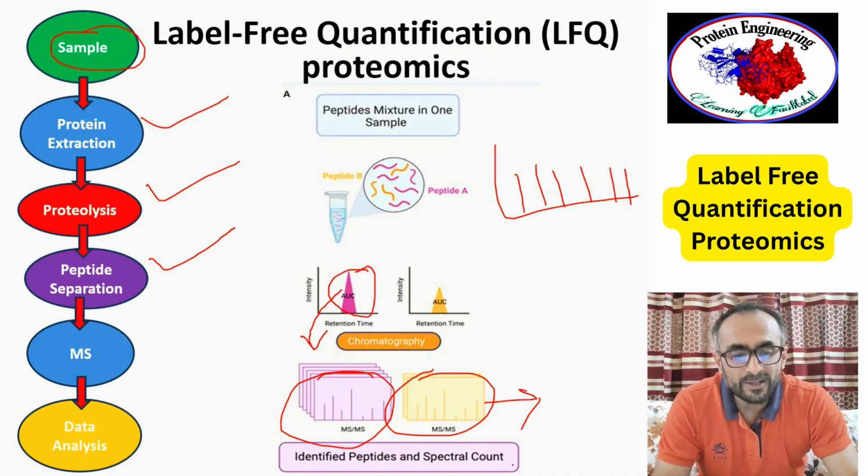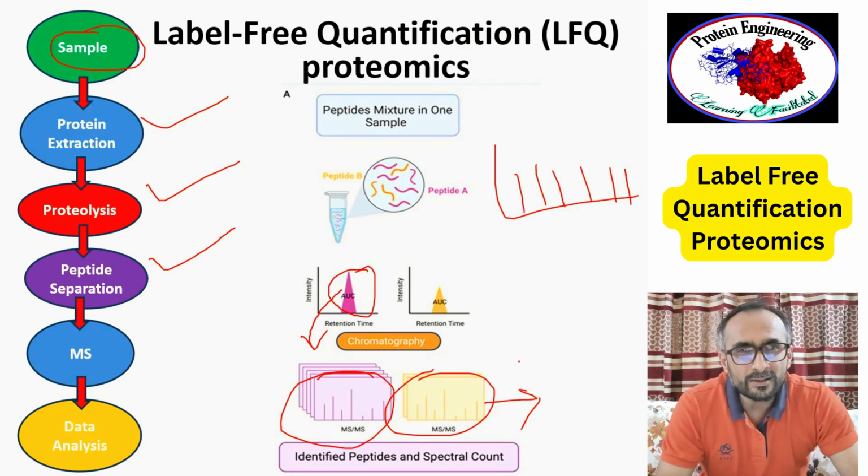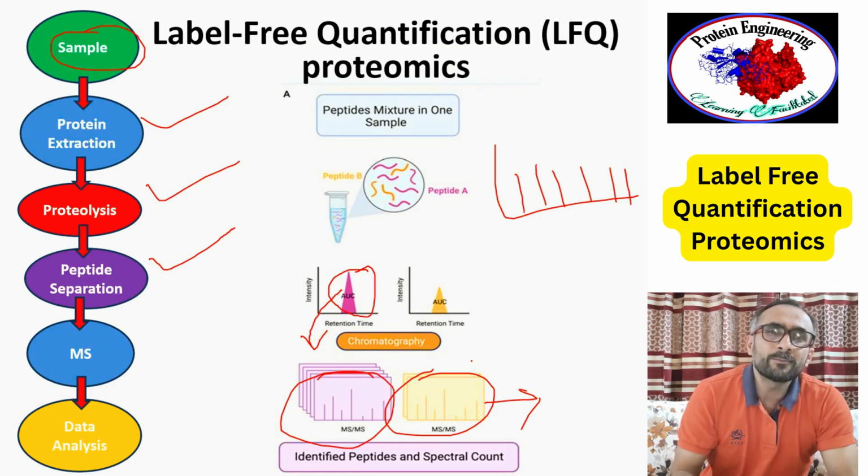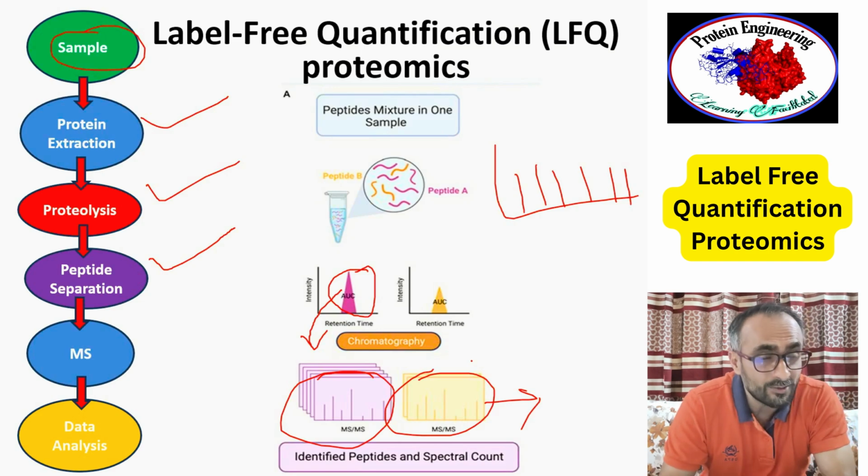So you will take the peptide sequence and search the database for similarities. By using a similarity search, you can find out which protein it is coming from. So from here you will know which protein is present in what concentration in your sample.